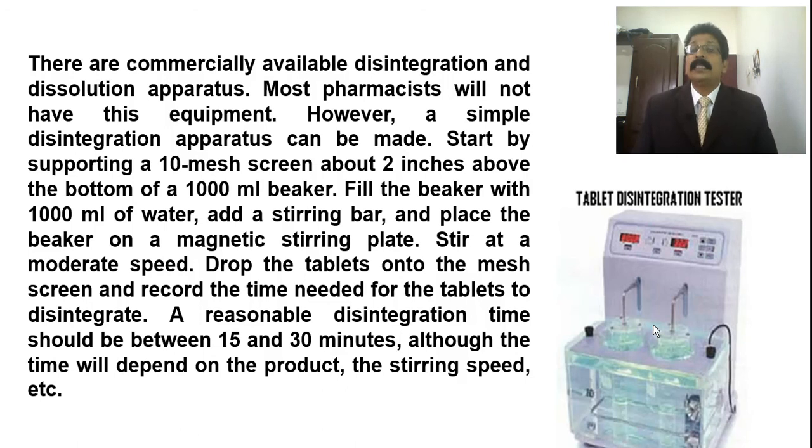So when the mesh number is increased, the fine powder can be sieved and separated, because an increased number means that 1 square inch has more pores. If the pores are more, the size of each pore should be small to cover this 1 square inch. That is the main principle which you have studied.